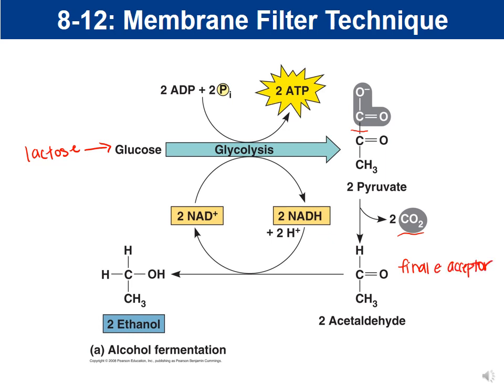acceptor. And again, it's going to darken with sodium sulfite. So if our colonies are dark, that tells us that the lactose was metabolized, because the only way you get colonies that darken is if the bacteria use the sugar.